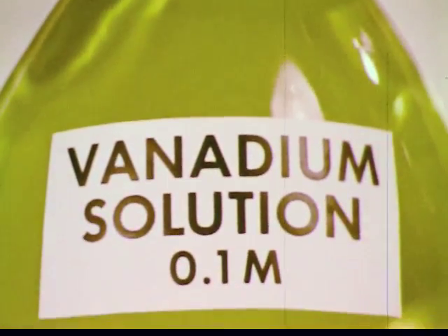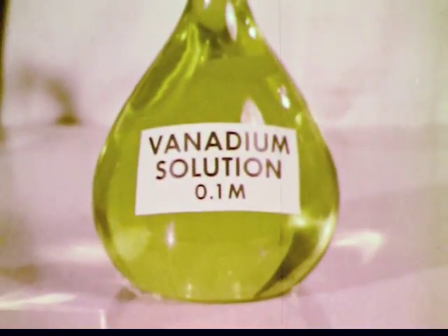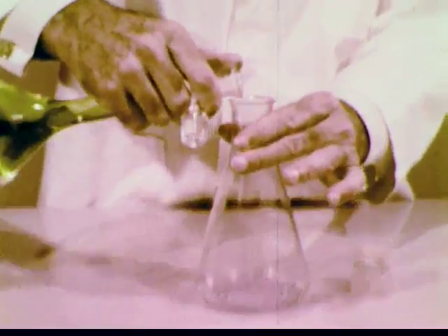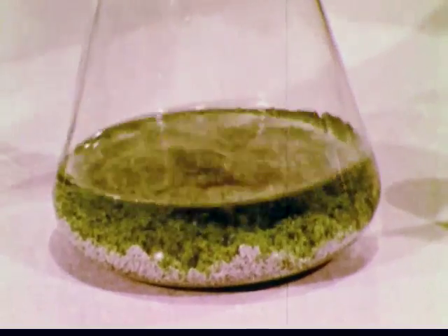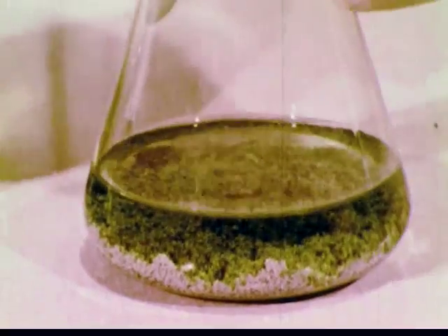Here is a standard solution of 5+ vanadium. Let's try to reduce it to other oxidation states. Zinc is a good reducing agent. The zinc in this flask has been shaken with a small amount of mercury to form an amalgam. A color change occurs in the vanadium solution as soon as it contacts the amalgam. The amalgam provides a large clean surface for the reaction and minimizes the evolution of hydrogen gas. Shaking the flask increases the area of contact between the zinc and the vanadium solution.